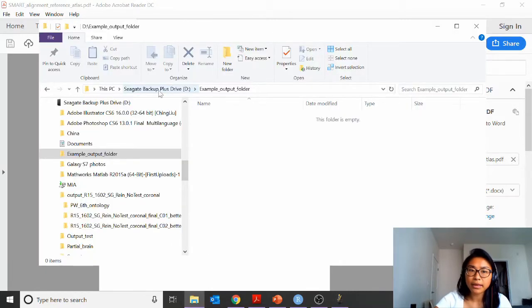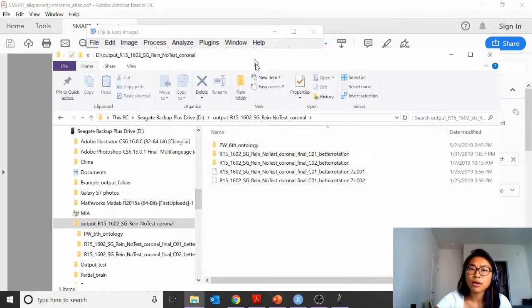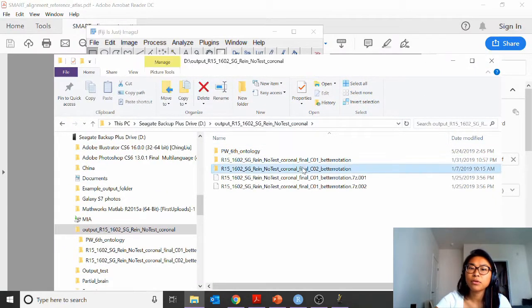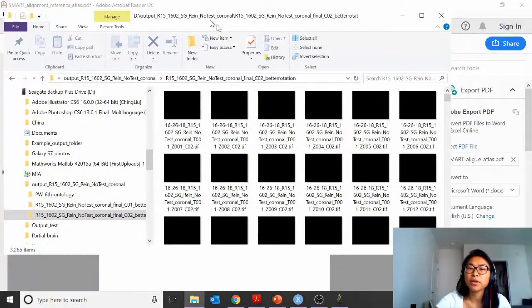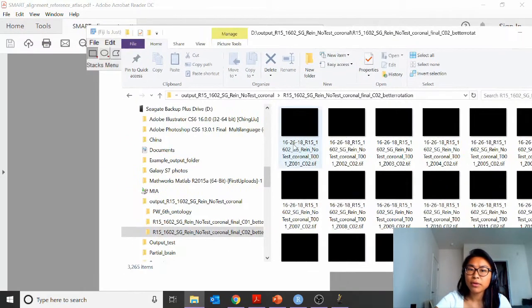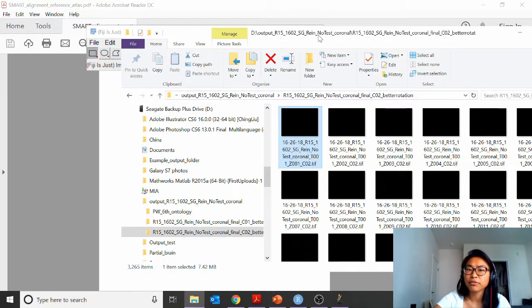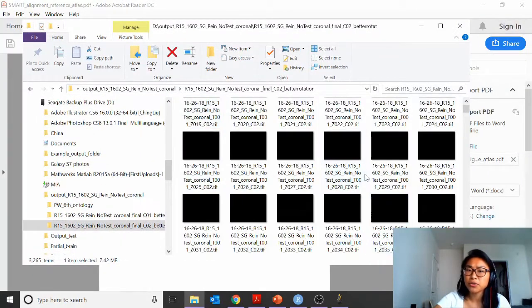So we'll go back into our raw data files, and we're going to look for the first usable image in our registration channel. If you throw in this first image here, based on the way this data set was scanned, there's actually a bit of empty space in the front of the brain. And so we want to find our first usable image.